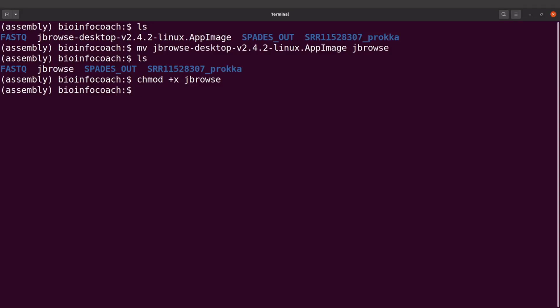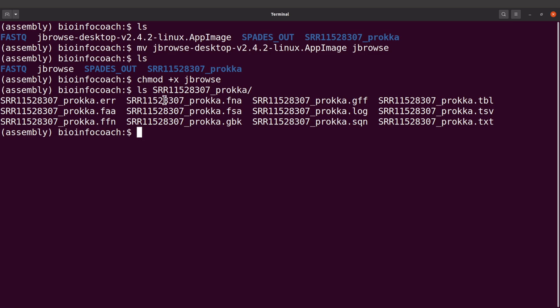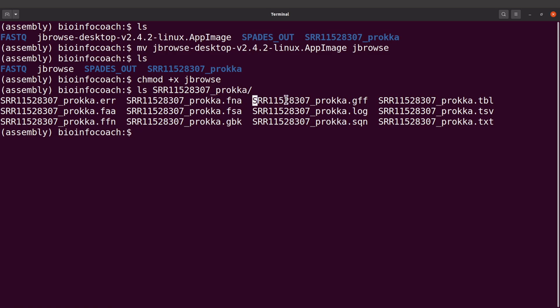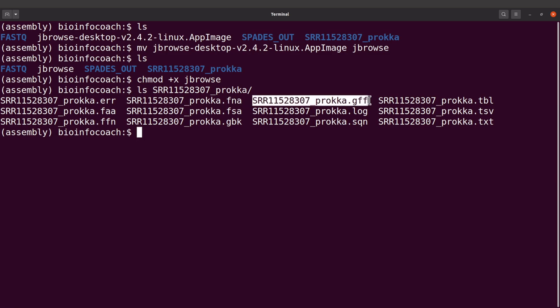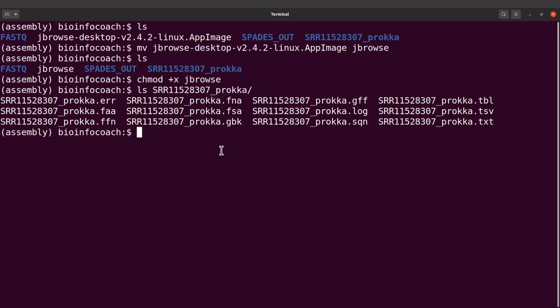So we have that done, let me display the content again here, I'll say ls. Okay, so we are going to visualize by feeding JBrowse with this file and then the GFF file. These are the sequences that were annotated. We have the sequences and then the features are here, so we just load JBrowse and load this. We will open JBrowse and then load this first into it and look at the annotations — it's going to be very cool, so stay tuned.